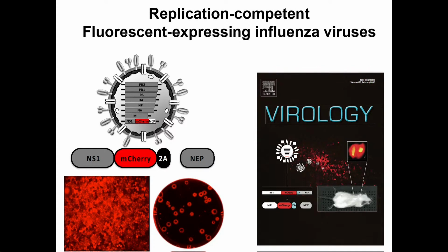Another limitation of this approach is that the reporter gene is expressed from the open reading frame 7A, and we did not see such great levels of reporter gene expression. For these two reasons, we decided to generate a new generation of reporter viruses that hopefully express higher levels of reporter and that do not need to remove the open reading frame 7A from the virus.